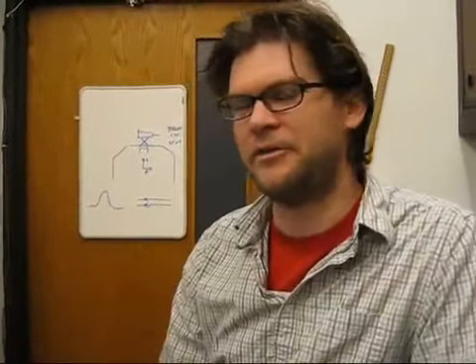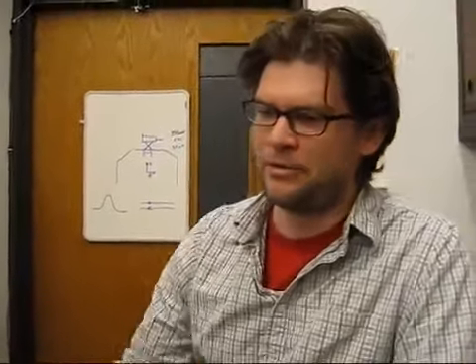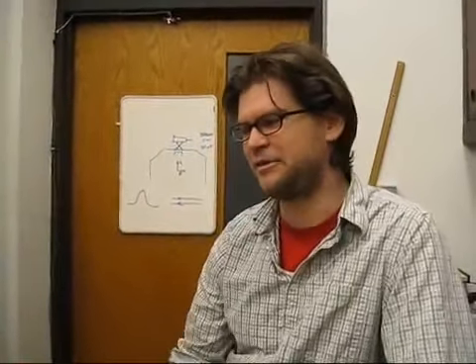Well, let me tell you about myself. My name is Derek Novak. I work in the Nano Development Lab here at Portland State. I work with Eric Sanchez. He's the PI for the lab. And we use one of Delmar's Ti:Sapphire crystal, or Ti:Sapphire lasers.